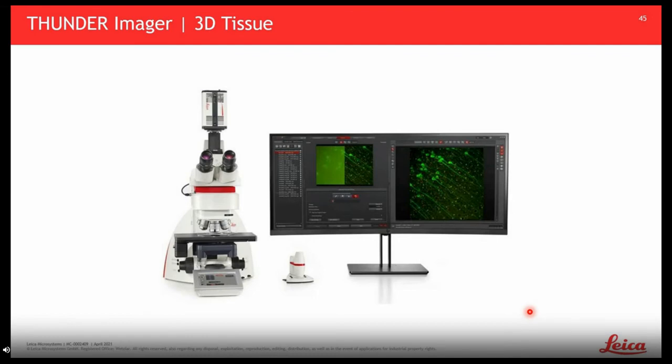As previously mentioned, Thunder is included in our family of Thunder imagers. Here's an image of the Thunder Imager 3D tissue. It's based on an upright platform. The 3D tissue imager is ideally suited for imaging your slide work. To see how Thunder can benefit such samples, here are a few examples.